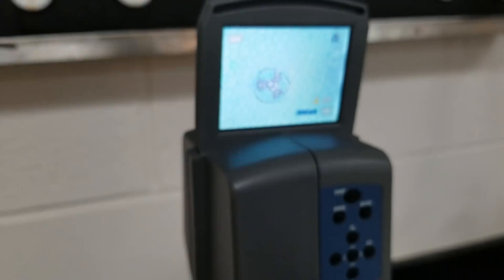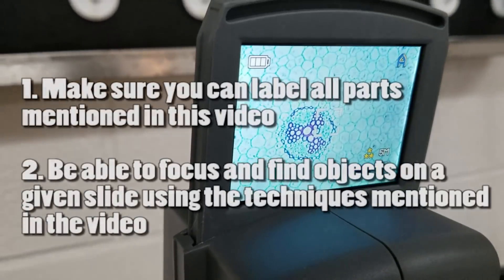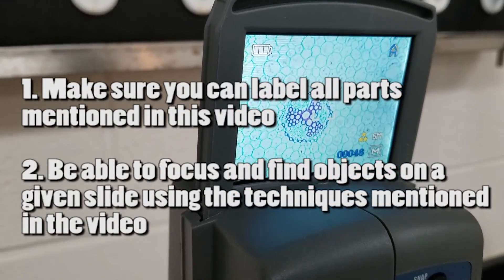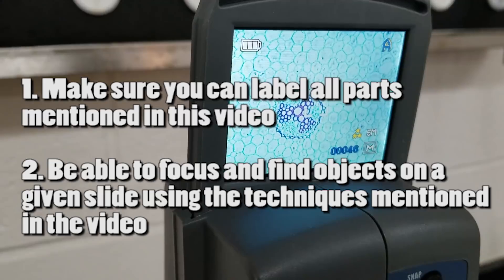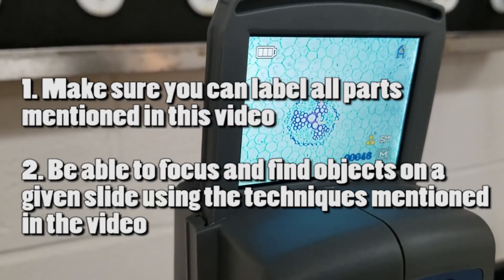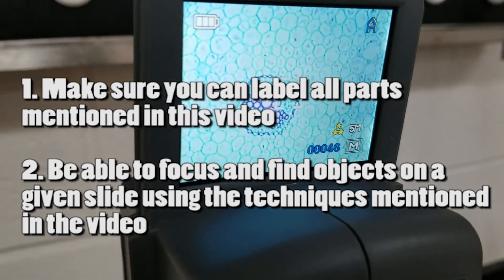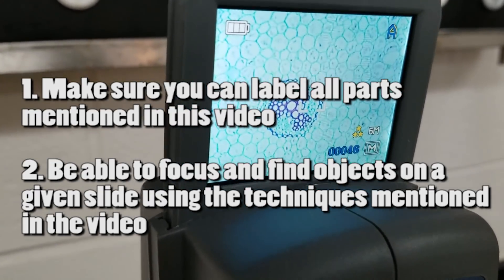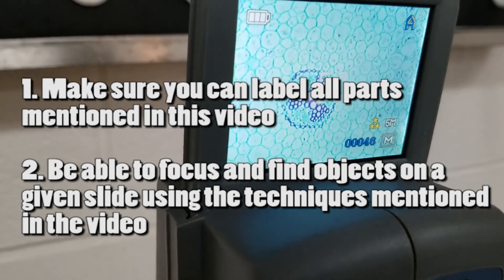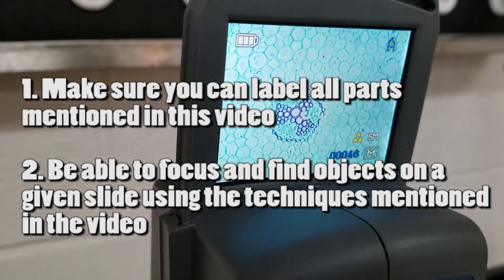That's pretty much it. So make sure that you know the parts and that when you come in, we could give you a completely blurry slide with no objective set up, nothing set up, and you could find the thing on the slide pretty easily. That is it.